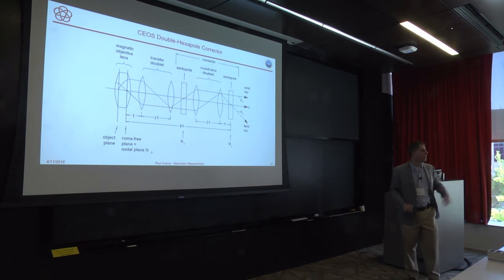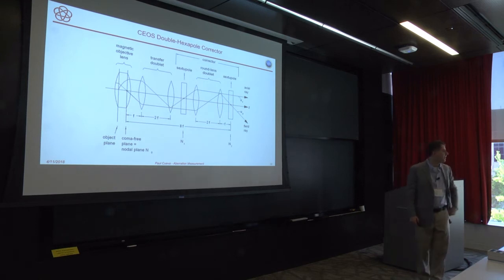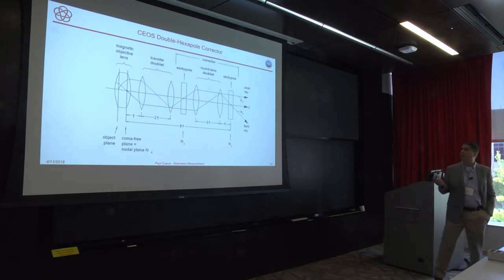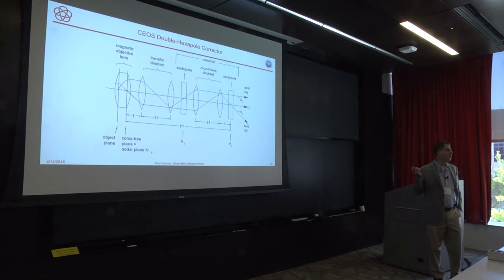And some of the aberrations are on the scale of 2 nanometers, right? And those things can drift over the period of minutes. And we get to line up this thing once a day. And then you have to do the rest of it by hand. Okay, so very, very hard. Alignment is hard and design is hard. In fact, it's not at all clear to me that we have the optimal design.